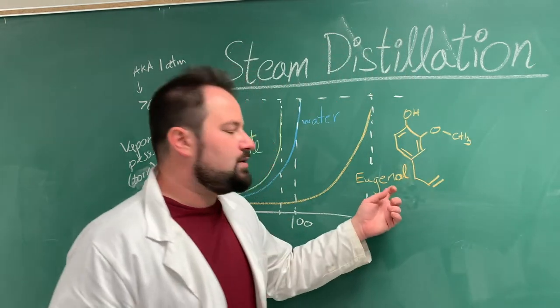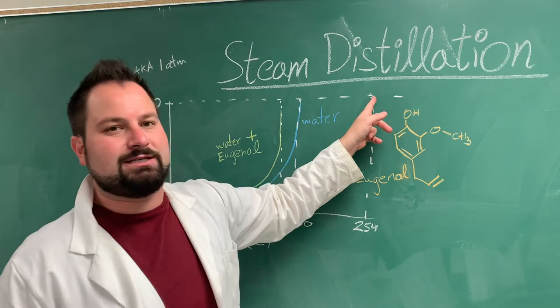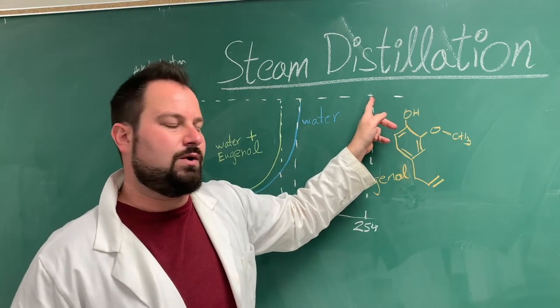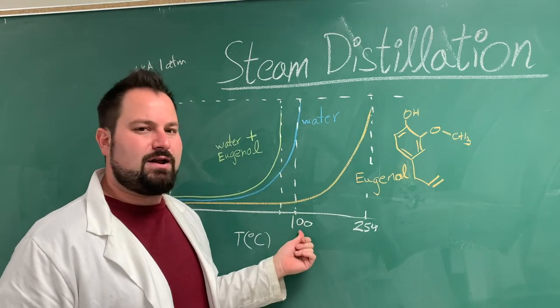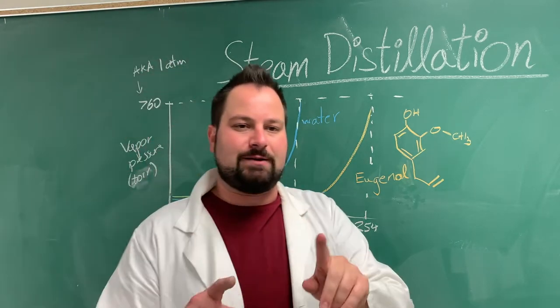Now, for eugenol, that's 254 degrees. That's when it reaches 760 torr. For water, that's 100 degrees C. That's when it reaches 760 torr. That's when it boils. But here's the thing.